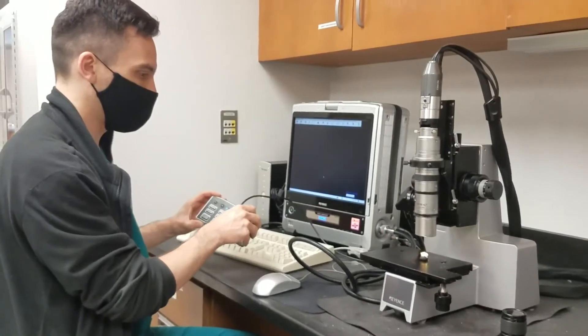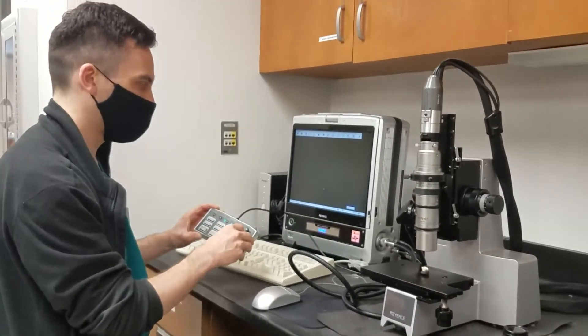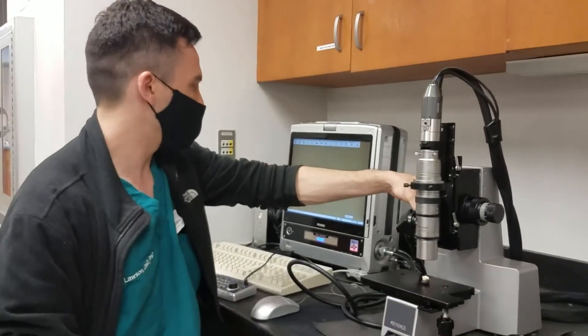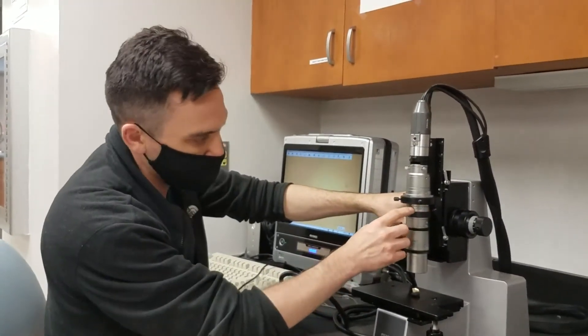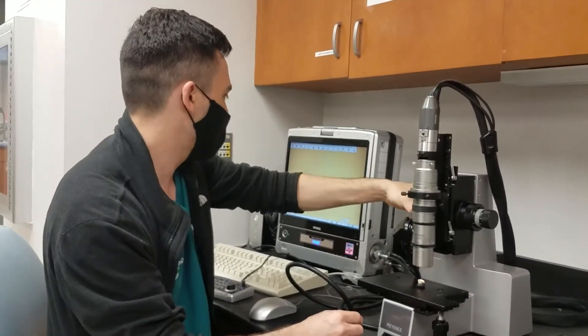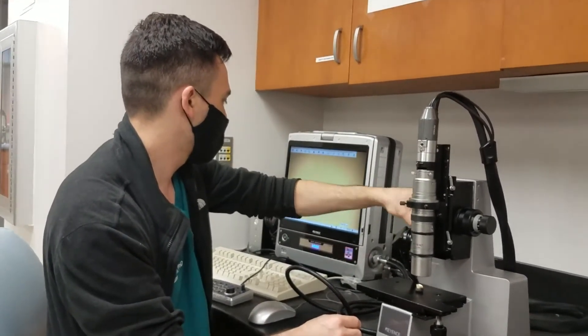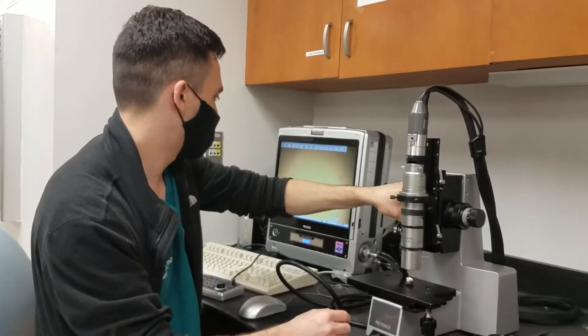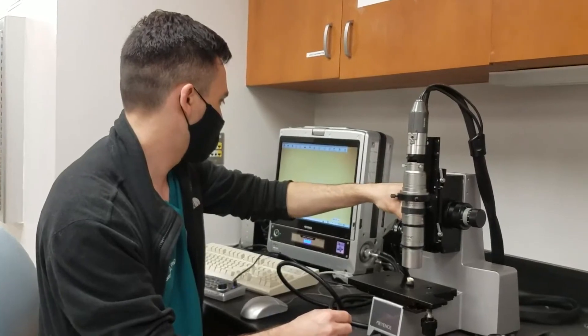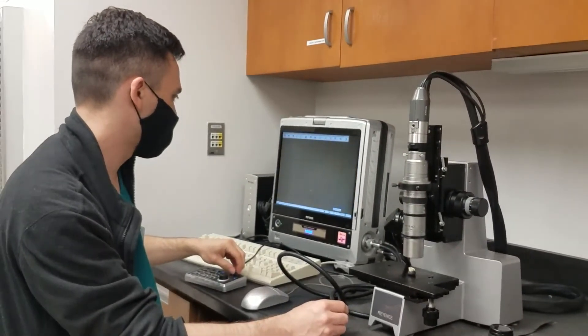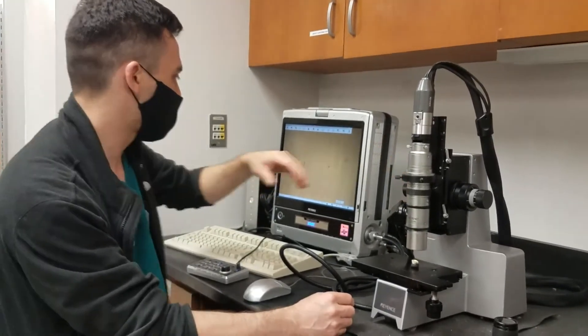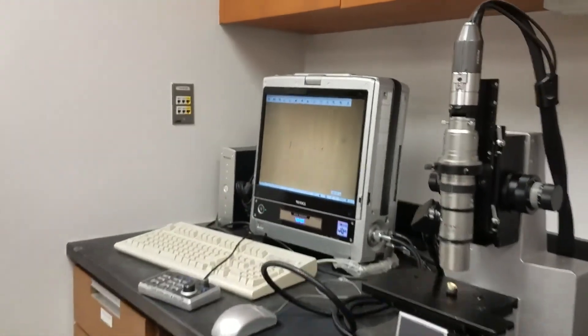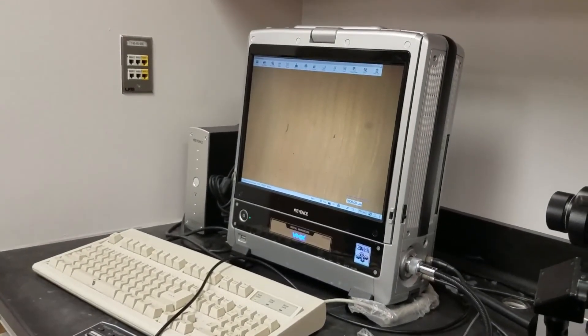And I can open up the shutter. And now all I have to do is, again, I like to start with the most zoomed out, so 100. And now I just try to get it in focus. Light's too high. And it's harder to get the 100 in focus. But I think we've got it in focus, and everything else is the same with this one.